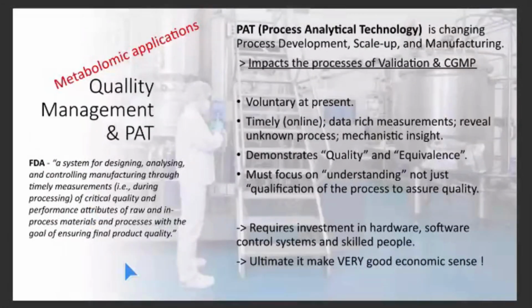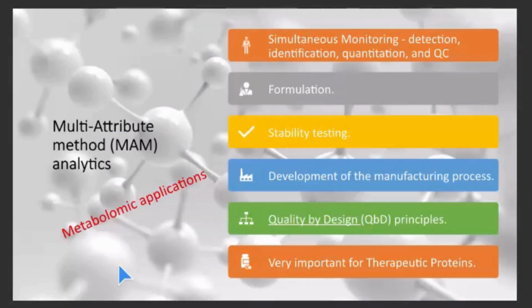Okay, these are all things now where we're starting to move away from, if you like, single gold standard measurements to say my product, my drug is safe, it's been produced in my bioreactor in a safe way. No, we're actually going for a much more holistic approach, which is a systems-wide characterization, and we're saying, using metabolomic data, if we have a broad profile of our metabolic production system that we compare between good batches and bad batches, we can use that in order to release our product and to show that it's safe and that its efficacy is actually still intact.